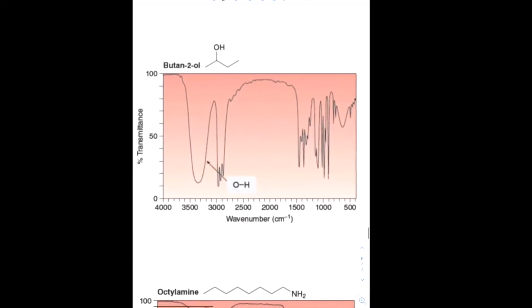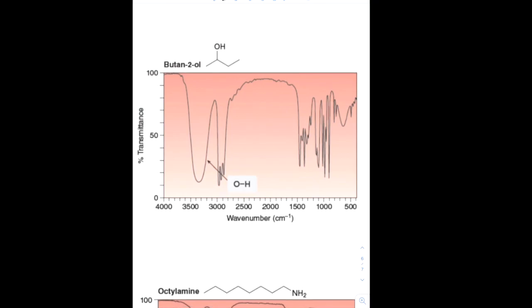All right, let's take a look at an alcohol functional group now. Pretty much get to ignore this region again from here over. You can see over here is a little bit more complicated now because we do have a C-O stretch in there as well. What we do have, which is very obvious, is the Csp3-H's, and then this super broad one right here, right? This is indicative of an O-H. Now notice the general range is right here to right here perhaps, because carboxylic acids are a little bit more broad.